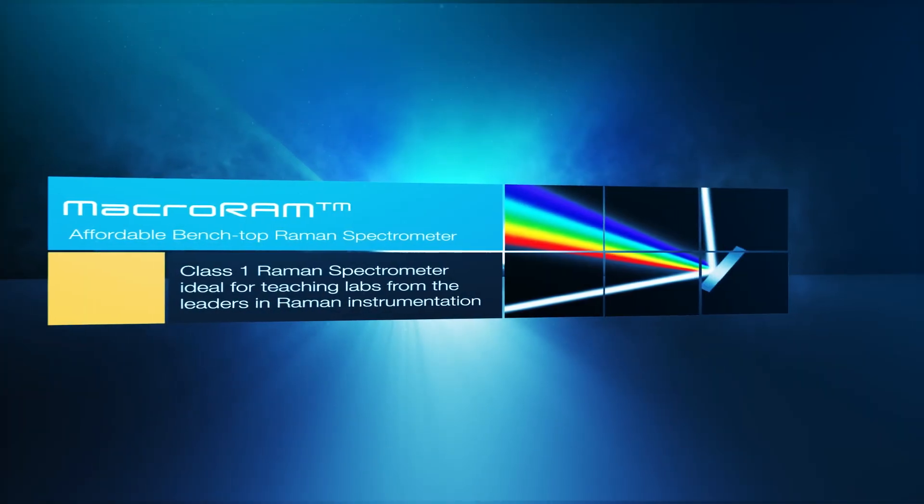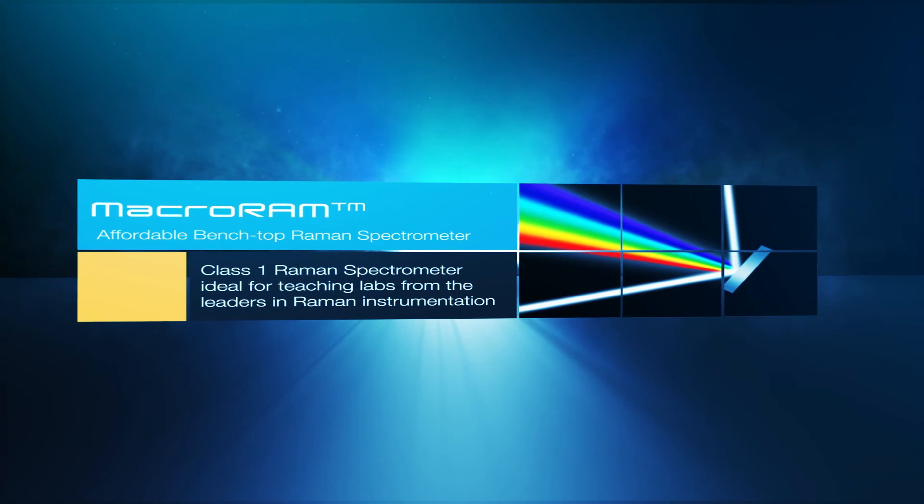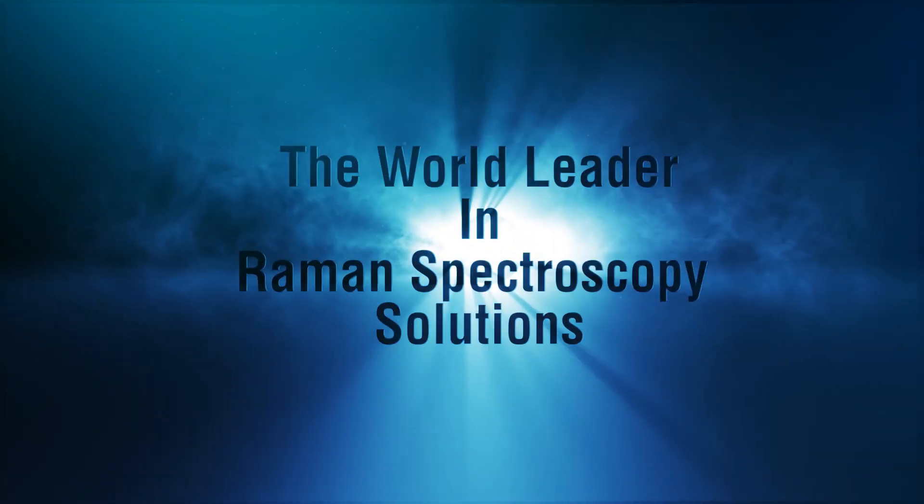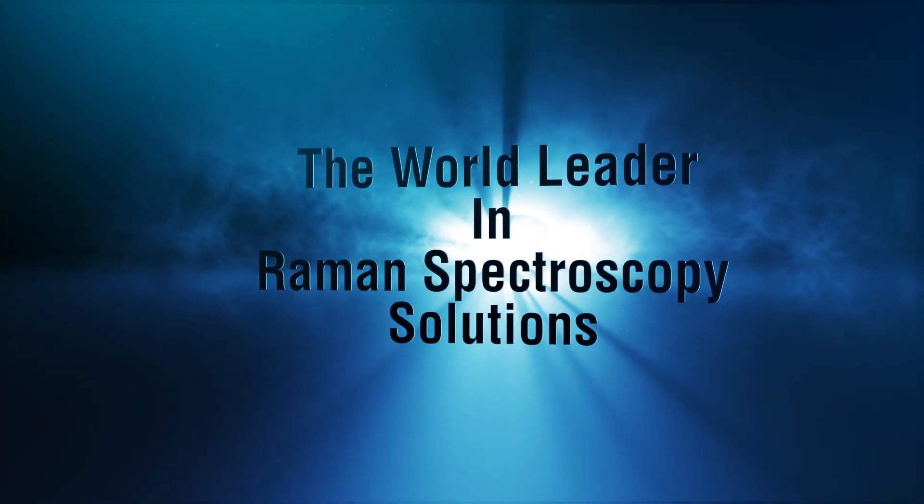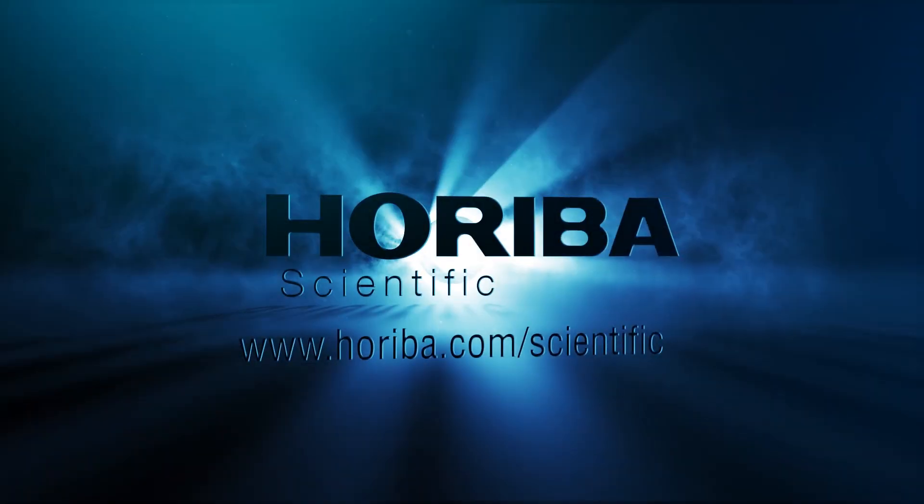Bring Raman measurements to any laboratory with the affordable MacroRAM from the world leader in Raman spectroscopy solutions. Horiba Scientific.